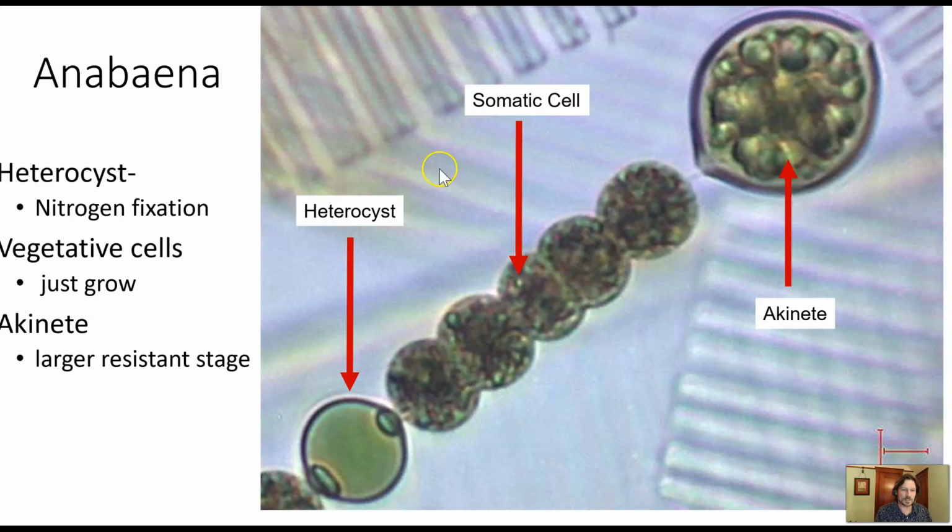Okay, so you can tell this is Anabaena because there are these 3 different types of cells. They're kind of roundish, and they're in a long chain called a filament. We will see another filamentous cyanobacteria, Oscillatoria, but the cells aren't round, right? They're like little disc shapes, and they all line up, so you can barely tell one cell from another. So they look very different when we see it. Okay, so this is Anabaena.